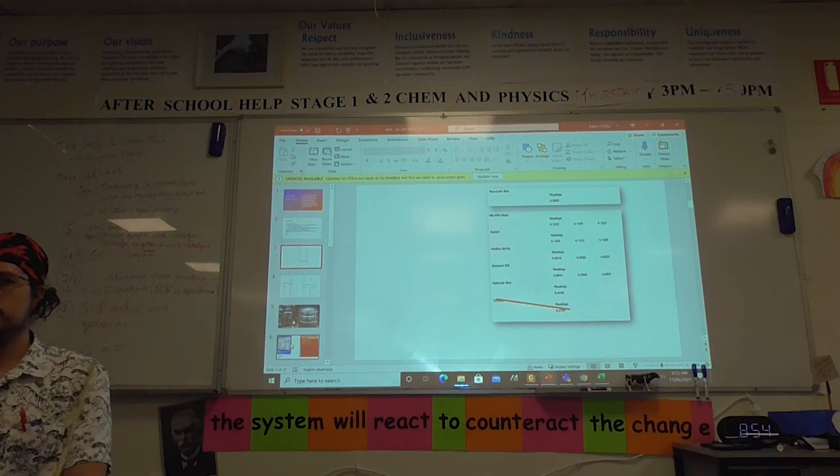As far as I'm concerned, these machines are generally quite accurate, so you can choose one that's close to others. But if you really want to rely on the results, choose one that's separate from all the others. It makes it better. Okay, is that enough information on AAS?